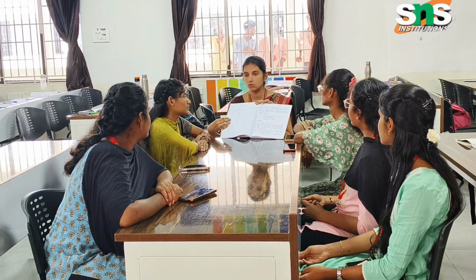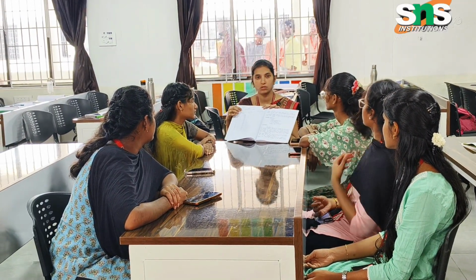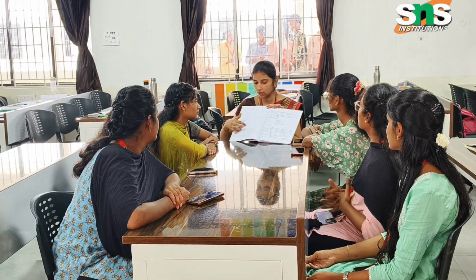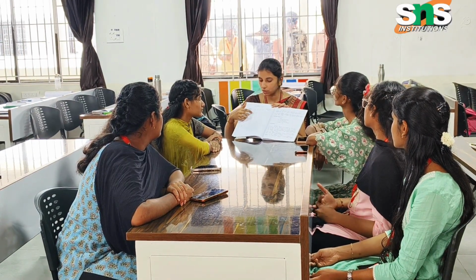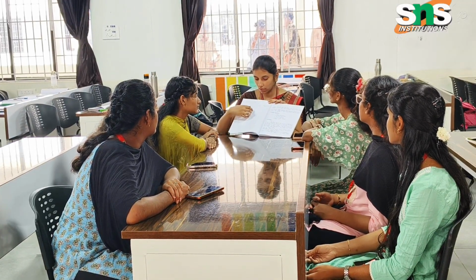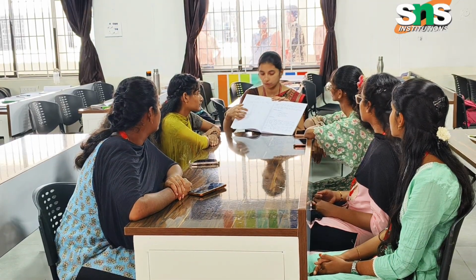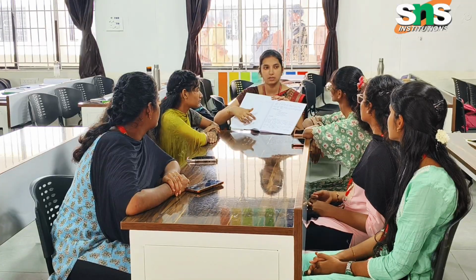Using these values, we have to plot the graph of the volume of potassium dichromate solution versus delta E by delta V. For that, we have to calculate using the formula in the table. We take the values from the potentiometer and calculate delta E by subtracting the first value from the second value. Likewise for delta V, the volume, we subtract the values, giving 1 ml. Dividing delta E by delta V, we can calculate these values.